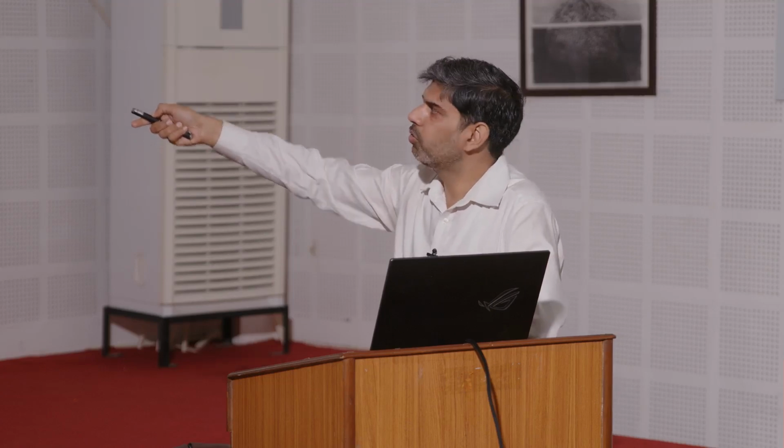So, let us see. You start with a straight band, and let us say you apply a non-uniform flow. What will happen? The solute in the middle is going to move ahead, whereas the solute at the channel walls is going to stay there, because my pressure-driven flow has 0 velocity at the walls. It is not like electroosmotic flow, with its plug-shaped velocity. So, you will have this distortion of the band.